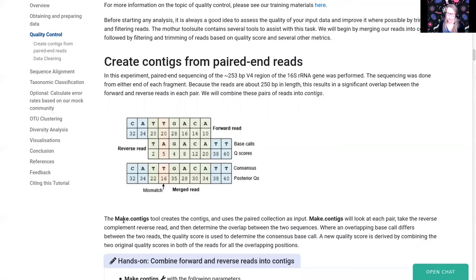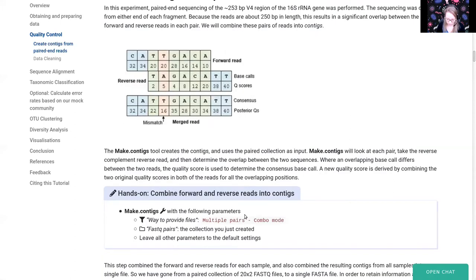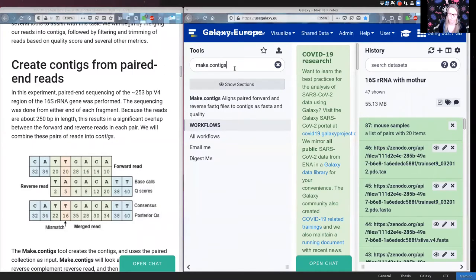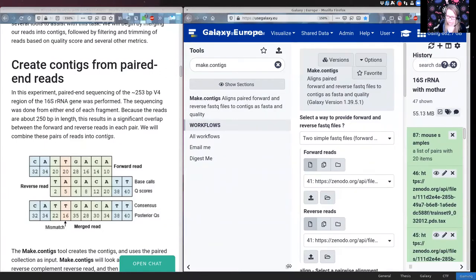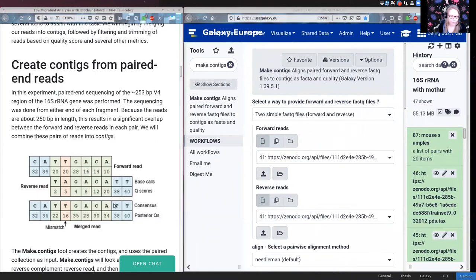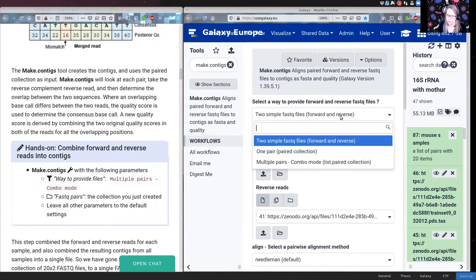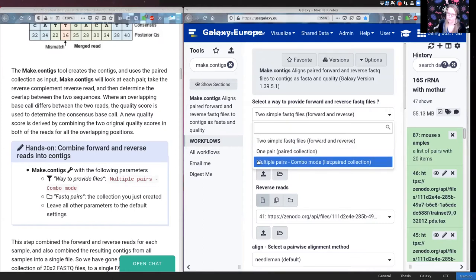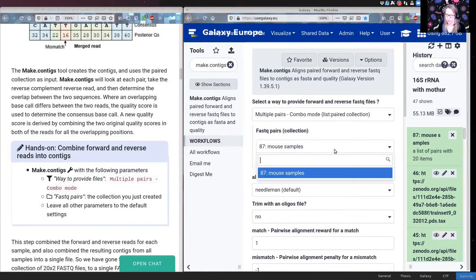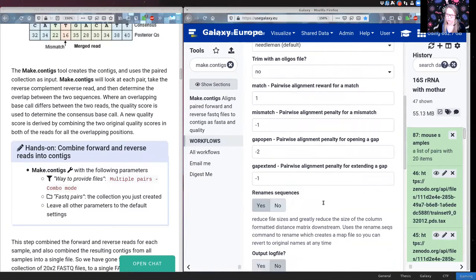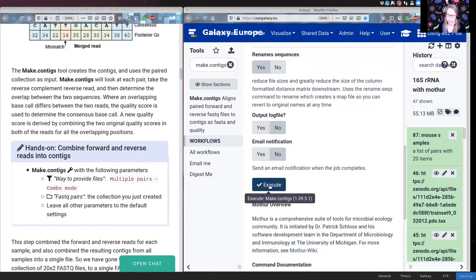In Mothur, the tool called make.contigs performs this step. Search for make.contigs in the tool panel. Since we have multiple samples, select 'multiple pairs' and indicate they are in the collection. It will auto-detect the one collection in our history. Leave all other parameters at their defaults and hit Execute. For each sample, it will take the forward and reverse reads, find the optimal overlap, and generate a consensus contig with improved quality.